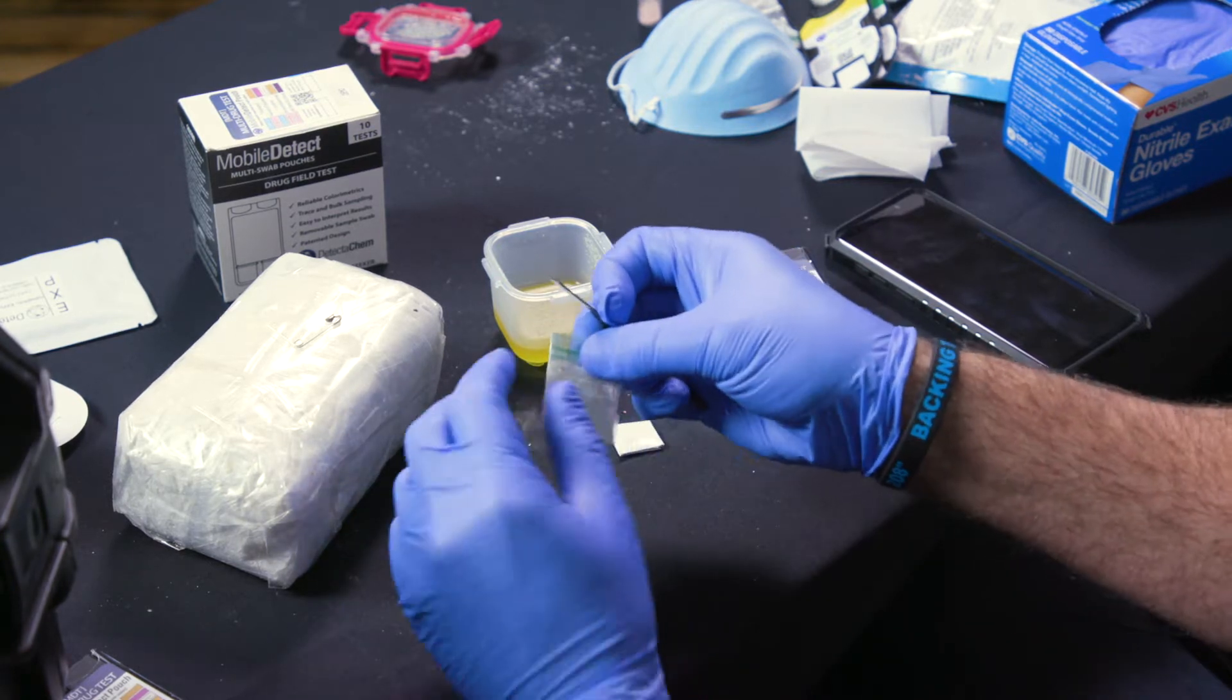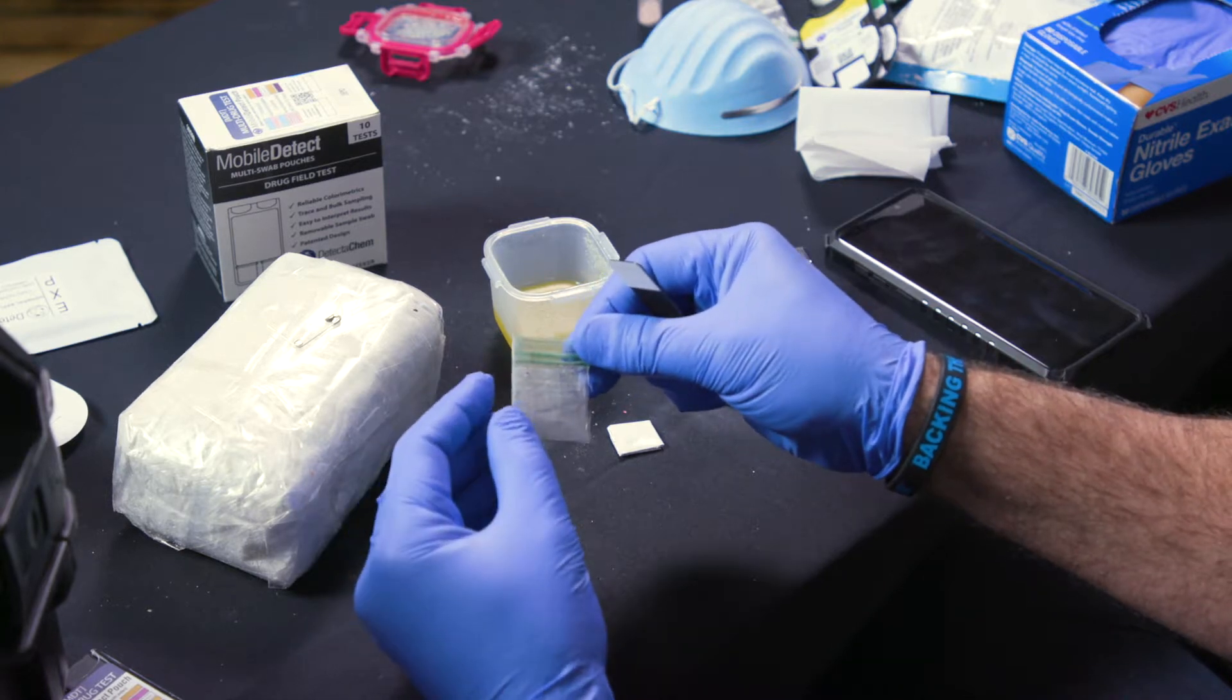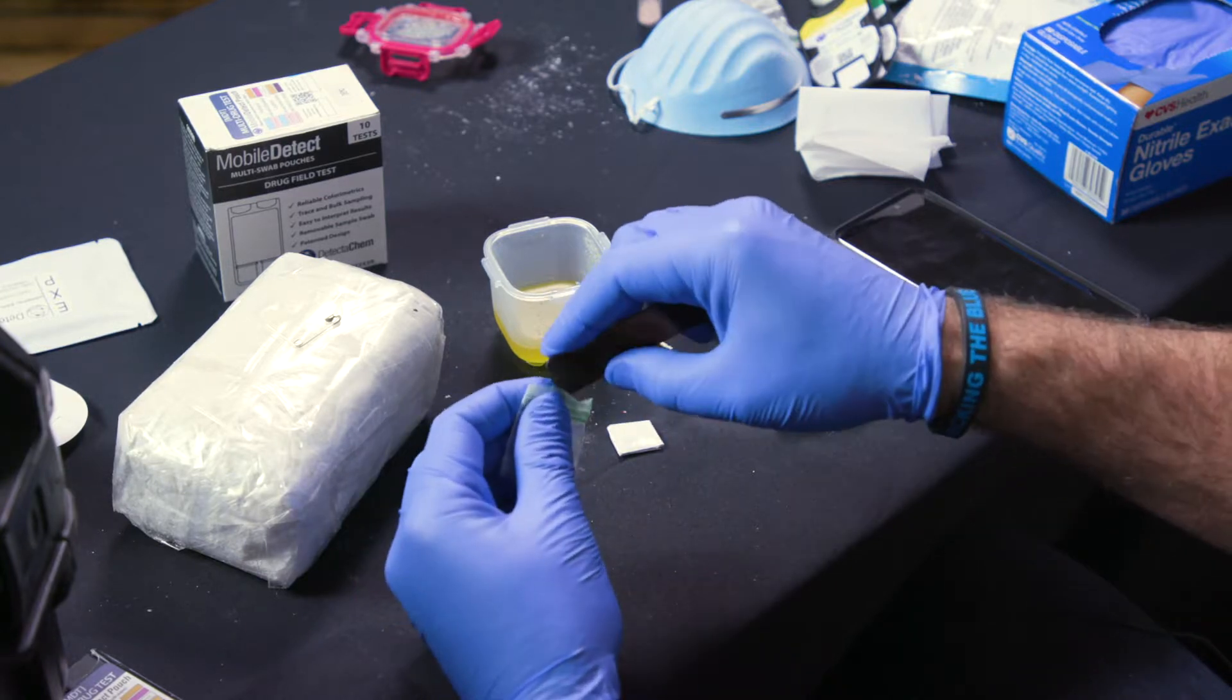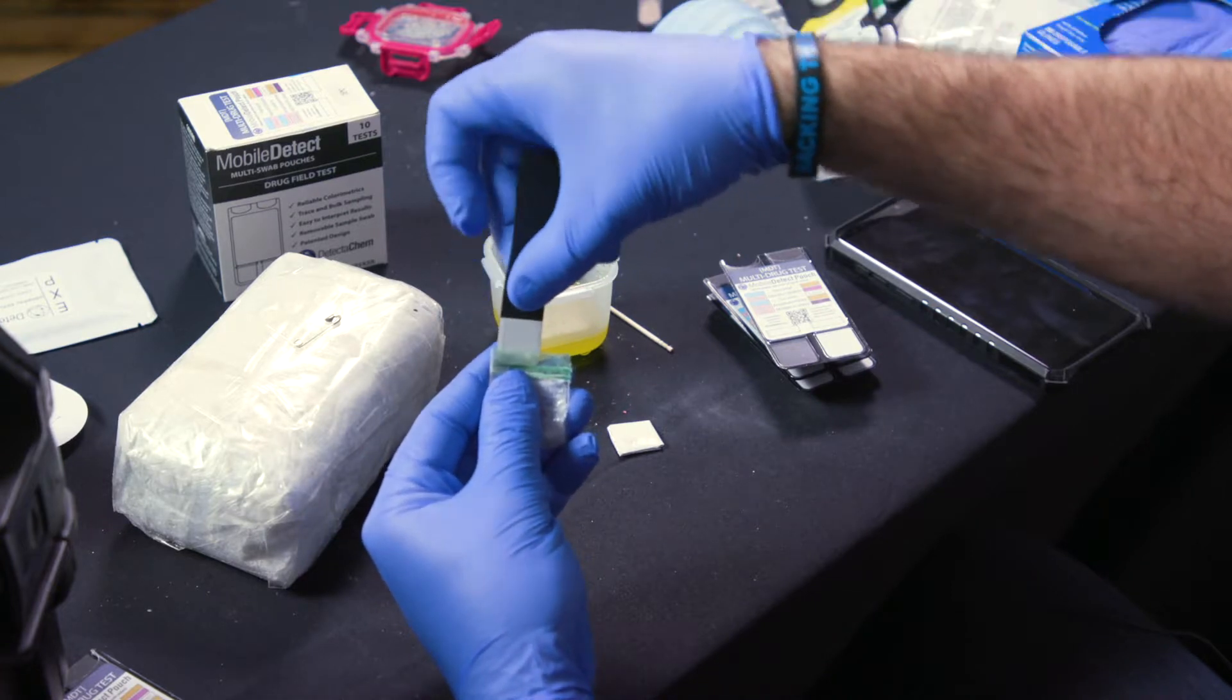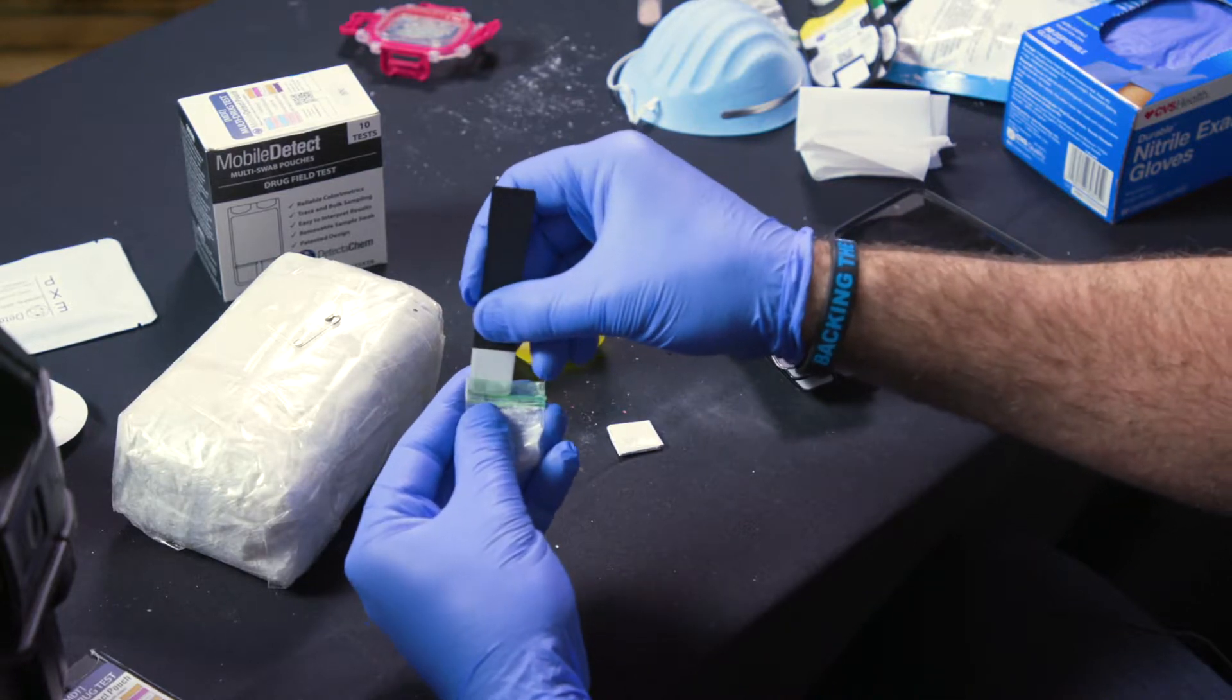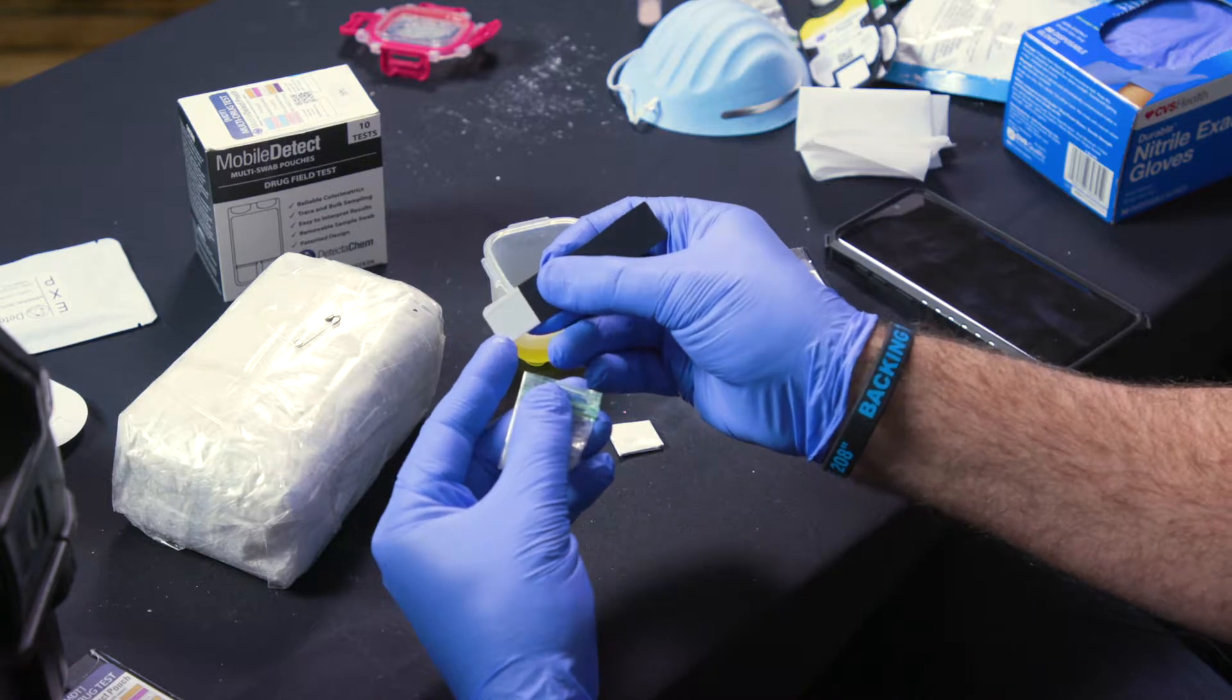For a small ziplock bag or really any kind of ziplock bag these are pretty straightforward to do without having to go into the bulk sample. What you want to do is you want to open up just the top and you want to insert the swab right into the top of the ziplock before the seal. Just swab that right there. There's almost always enough residue there to be able to get a very solid detection.